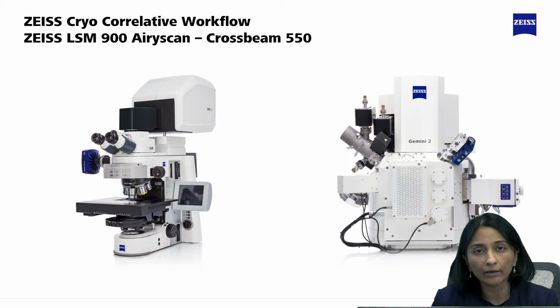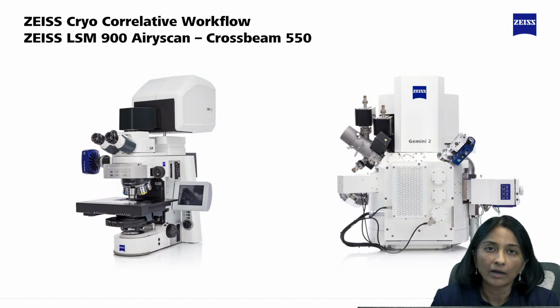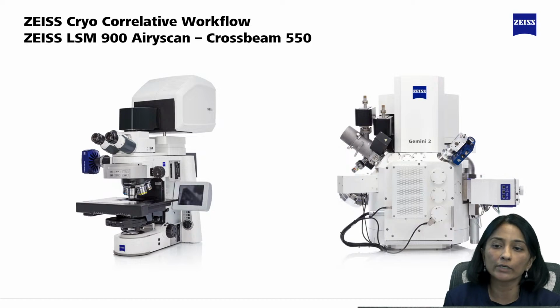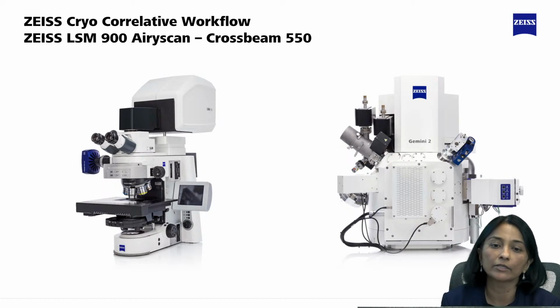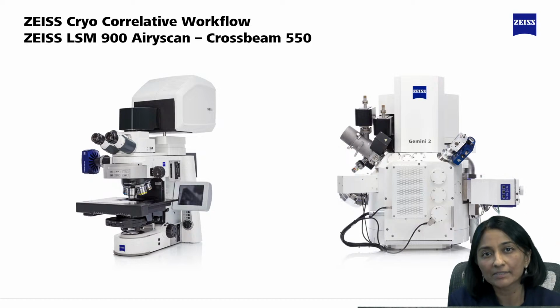So cryo microscopy essentially is imaging grids or samples on a grid that have been vitrified and in the near native state. So you can image the same sample and the same grid between two instruments. What you see up on the screen is our LSM 900, the light microscope, and the exact same region can be imaged on our crossbeam or the focused ion beam scanning electron microscope.